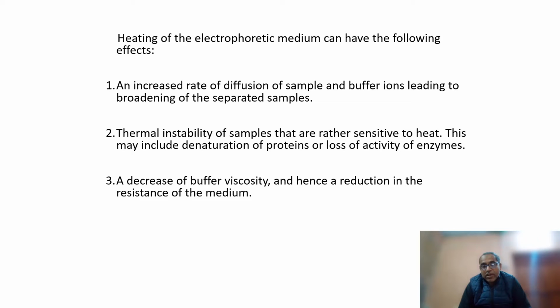Then the production of more heat would result in a decrease in buffer viscosity and a reduction in the resistance of the media. So if you increase the voltage, the movement of the molecule will be faster, but the resolution will be low. However, if you decrease the voltage, the movement will be slower, but the resolution will be good.